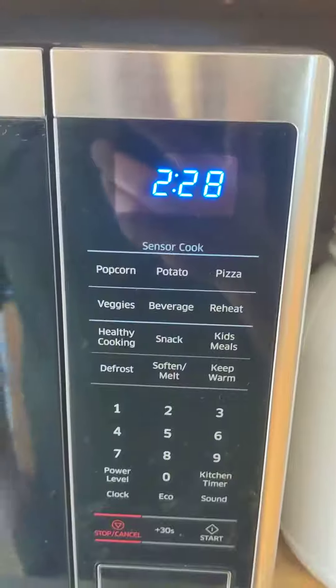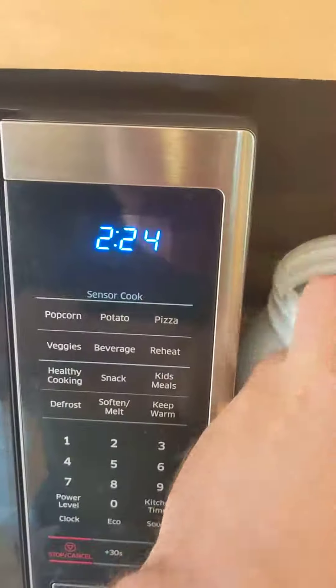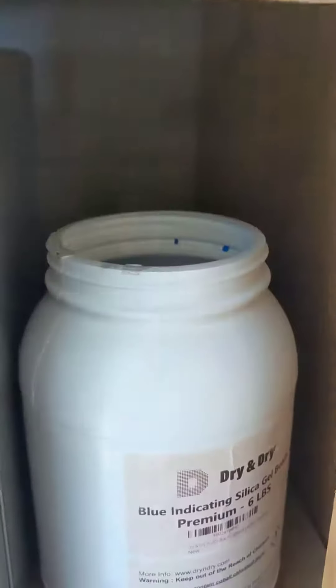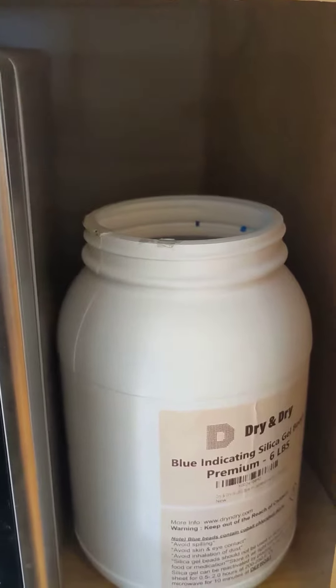If we run this for another minute or so, the product that we get back will be this color and we'll be able to continue to use it to desiccate tissue samples.